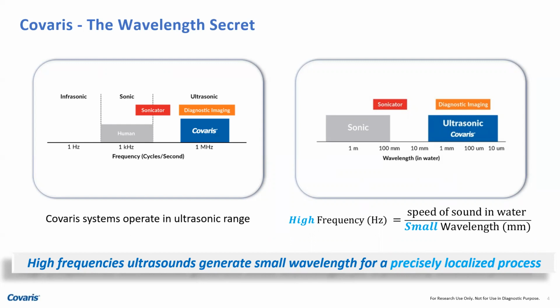So most of the next-generation sequencing labs that are working with tumor tissues or cells, looking at whether they're cancerous or not, they look at the genomic profiling. So they look at DNA and they want to have DNA of a specific size. For those who are not in this space, it's for them. Those who are already working in this space, I'm preaching to the choir.